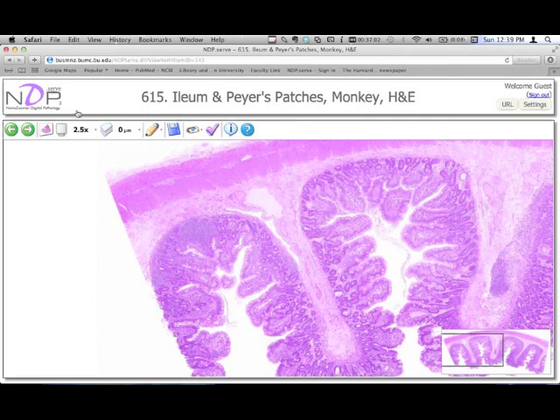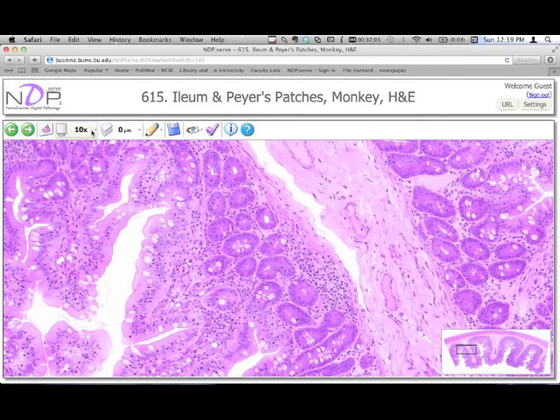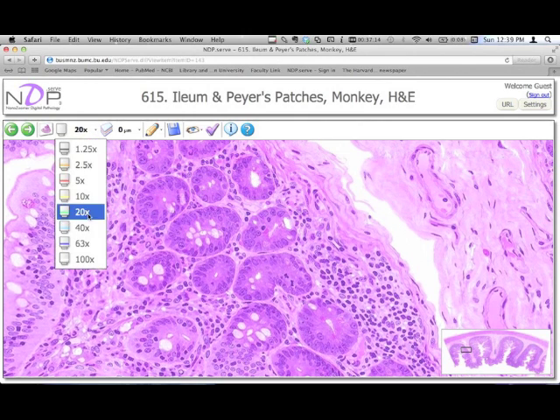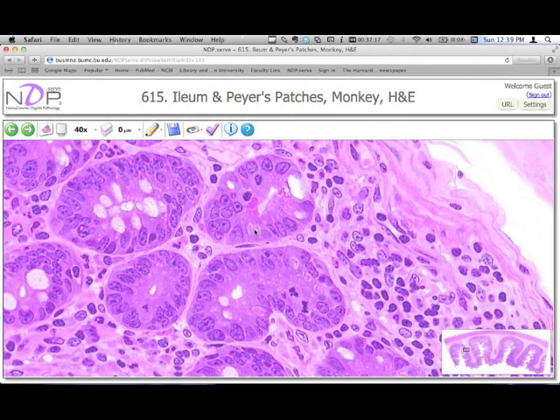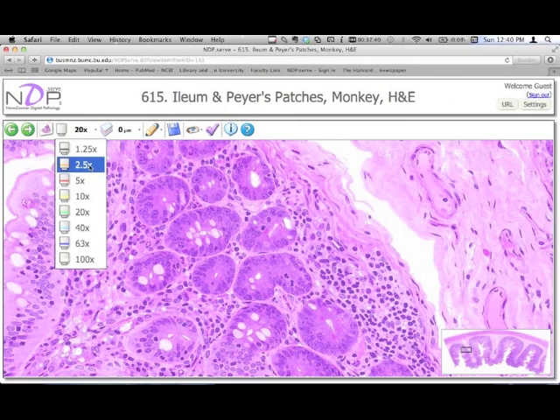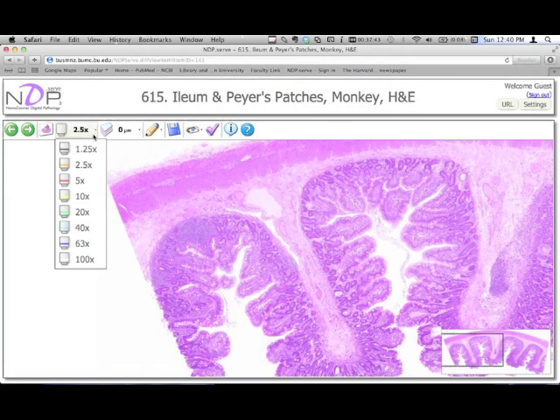So, goal number one is to figure out what eosinophilic granules look like. And once we figure that out, then we can identify which of these cells we're talking about. So if we go into higher magnification, around 40, we can see that these small circular profiles, much smaller than the nucleus, pop out at us. And we see them very nicely demonstrated here. So there's some there, around here, and here. And since this is underneath the epithelial sheet, we're down here, epithelial sheet is here, we are going to be tempted to make our identification there.